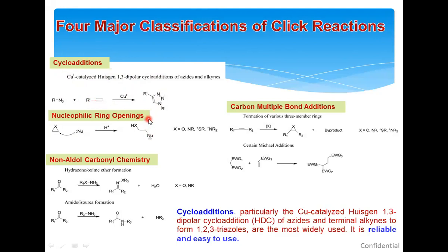The click reaction is unique because the azide moiety is absent in almost all naturally existing compounds. It lacks reactivity with natural biomolecules and consequently undergoes ligation only with a limited set of partners. So when you are using this reaction to see an output, there will be barely any interference from any third molecule.